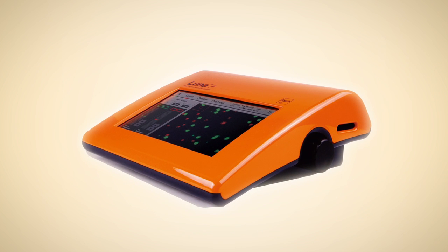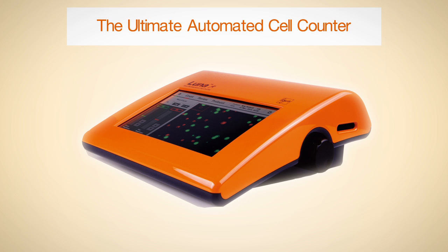To learn more about the affordable Luna FL, the ultimate automated cell counter, please visit the Logos BioSystems website.